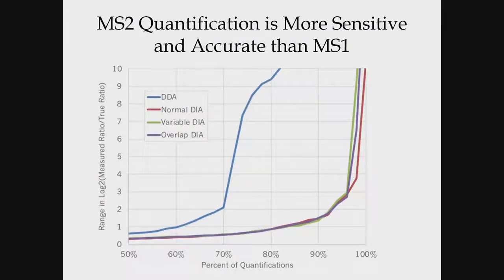Okay, so this is something that isn't always intuitive for everybody. The plot's going to take a little bit for me to explain. So what we did is a fairly simple experiment. We took about 660 peptides that Brian Searle was pretty interested in within the lab, and he performed parallel reaction monitoring on them. He did 0.7 mass-to-charge precursor isolation on 660 different peptides through many different injections to measure the quantity of them between a series of different samples.